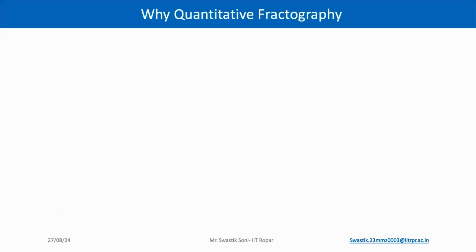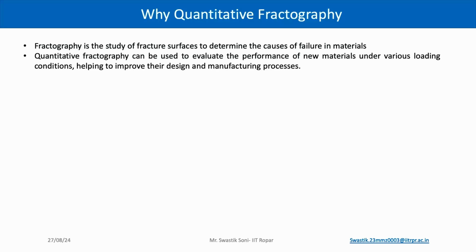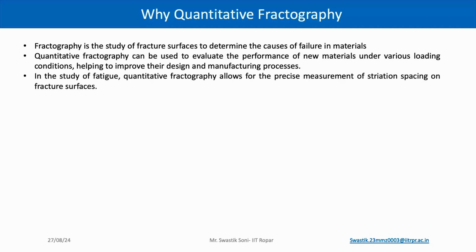Starting with why quantitative fractography. Fractography is the part of material science which determines the cause of failure in materials. Quantitative fractography can also be used to evaluate the performance of new materials under various loading conditions, helping to improve their design and manufacturing process too.